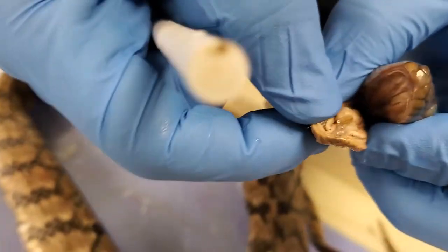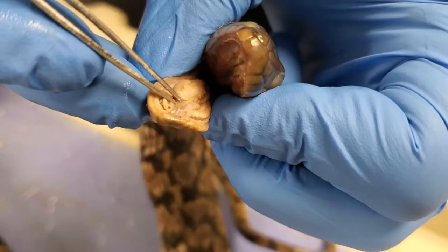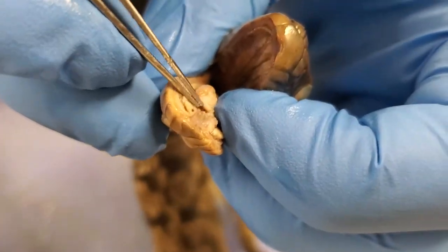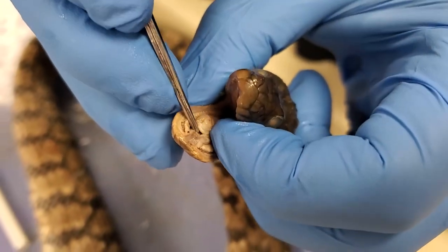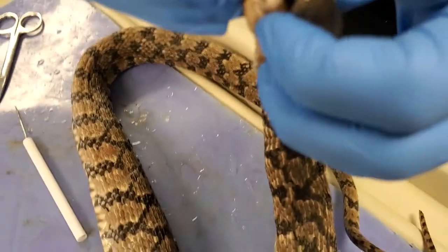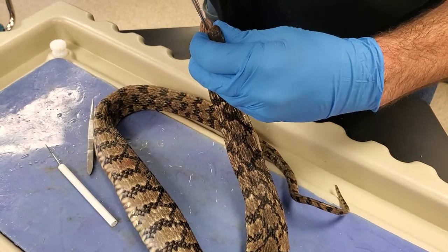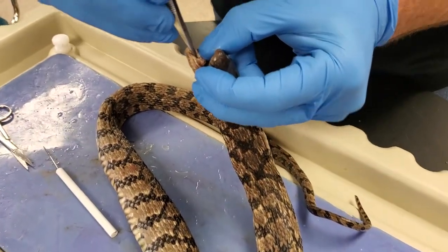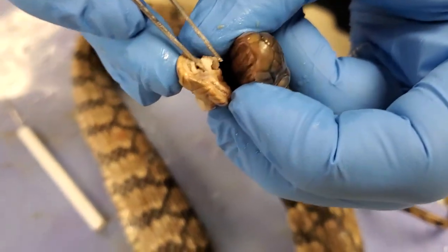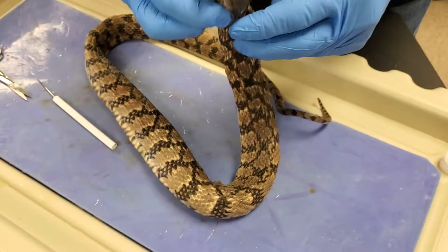And while we've got the snake open too, this is where the tongue comes in and out. It's got a little sort of a sheath, like the way you put a sword in or something like that. And here's the tongue — see if I can get it pulled out. There it is, just peeking out. Little tongue right there. You'll see it's forked. It's pretty deep in there, so I'll do a little quick snip to see if I can get to the tongue that way. She doesn't want to come out — that tongue is down in this little orifice, sunken pretty far in there. So that's the snake's face there.